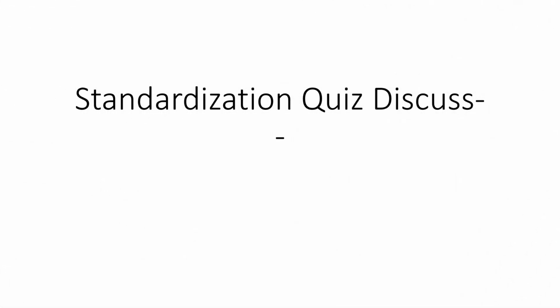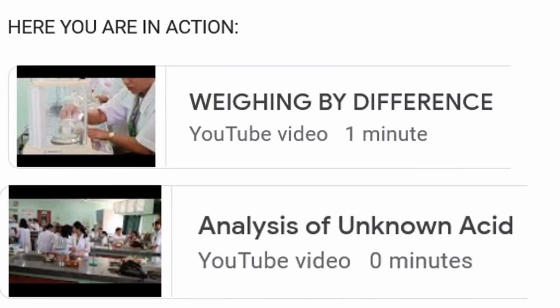Hello everyone, this is a discussion of the questions given in the quiz. Let us first recall the activities we performed in the lab, particularly weighing by difference.